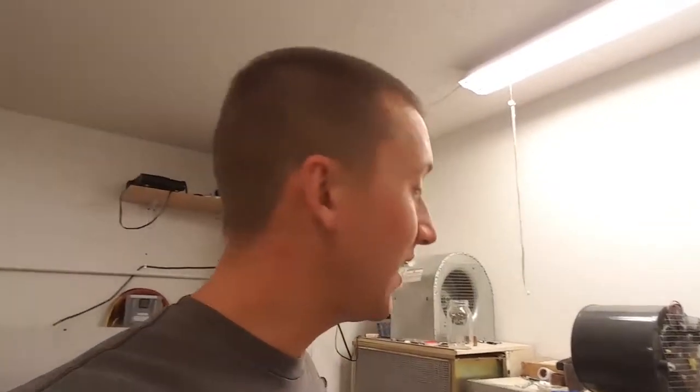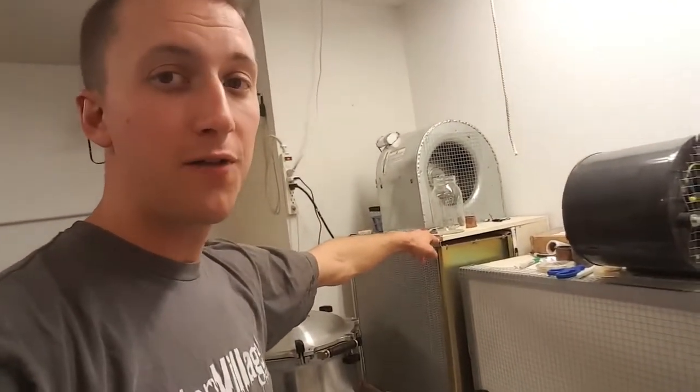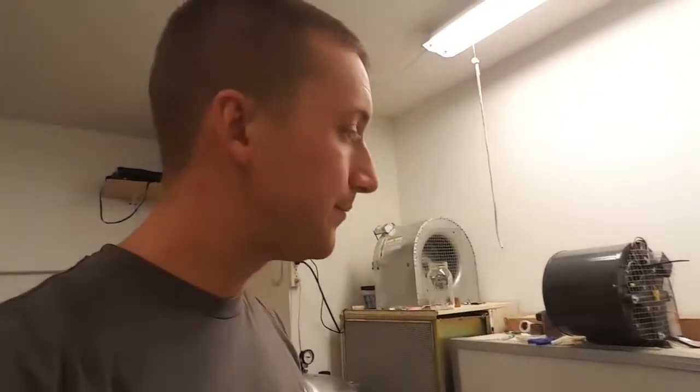My one piece of advice is: always go bigger. If you're thinking about a 12 by 12 flow hood, think twice. I would say at least 20 inches tall if you're working with bags — though 20 is even a little short, 24 inches is much better because the better bags are about 17 to 18 inches tall. Right now I have to crunch my bags down to inoculate them to fit the height.